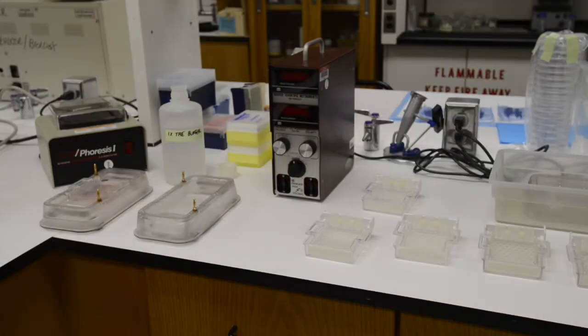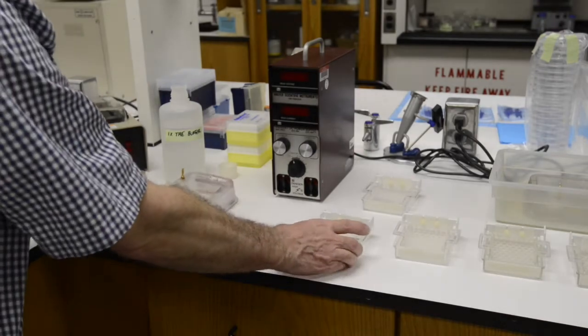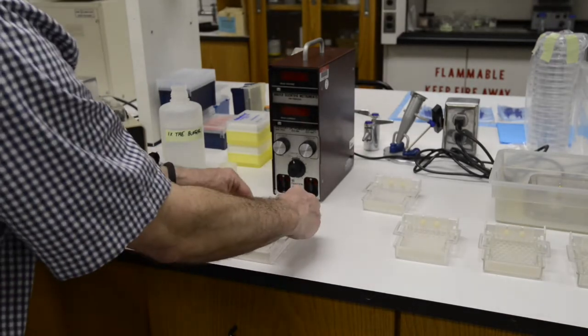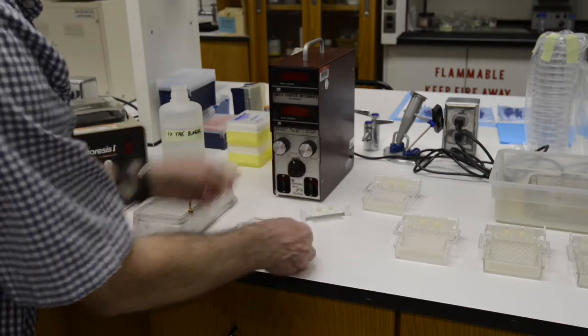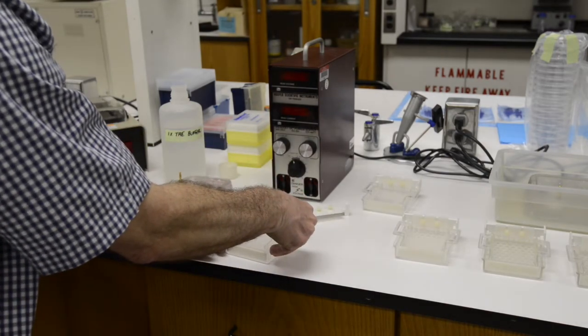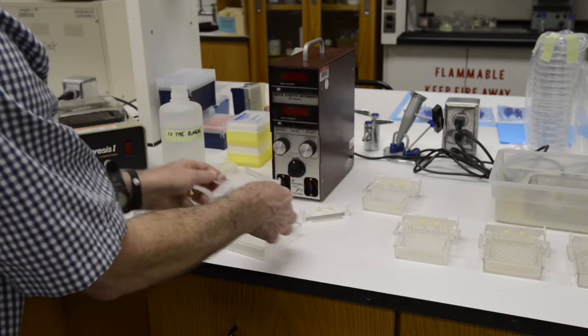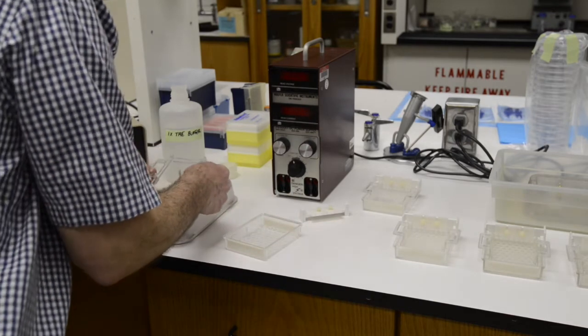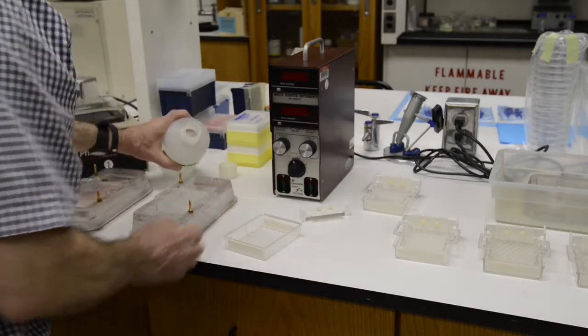Once the gel has solidified, then get your running tray. Gently pull the comb out of the gel by pulling directly upright. And then gently pull the casting tray holding the gel out of the casting unit and place it in the running unit.